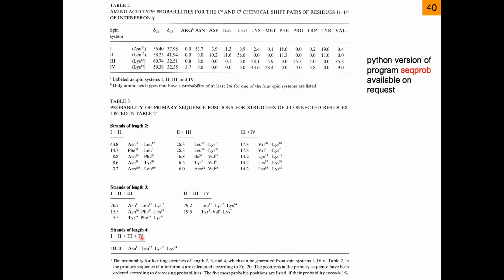And if you take 4 of them, it's completely unique. And you can actually just do the statistics and show that even for a protein of 1,000 amino acids, it becomes unique. So it's the combination of knowing that there's the sequential connection and the primary sequence information and this rather blurry distribution, but that works.